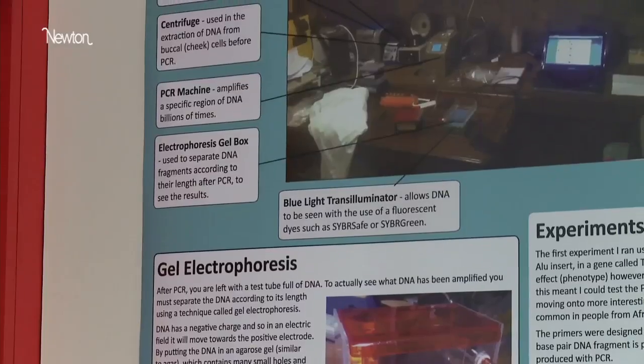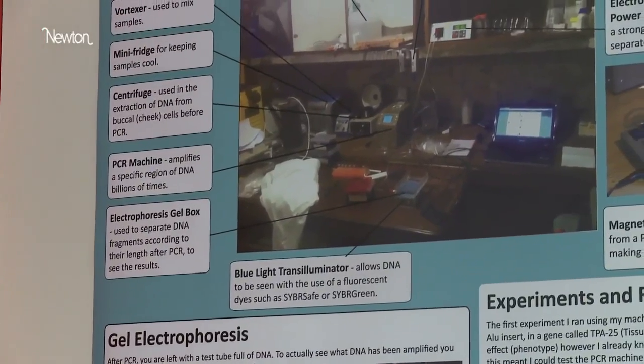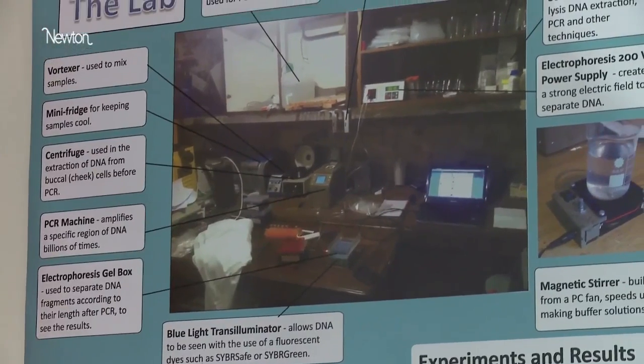Now I have a working PCR machine, so I can actually start doing experiments with it. My mum and my brother are ginger, so I wanted to look at the gene and pinpoint exactly what it is that makes them ginger — and means that I'm not ginger.